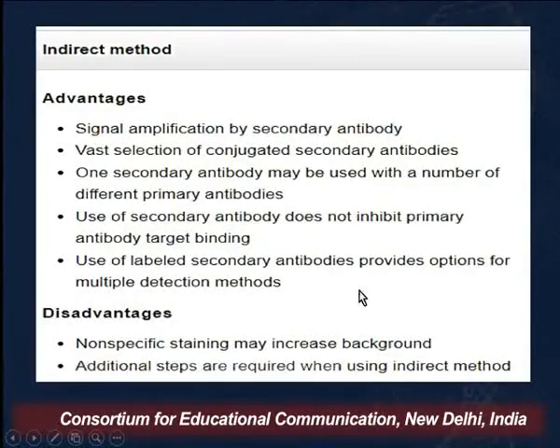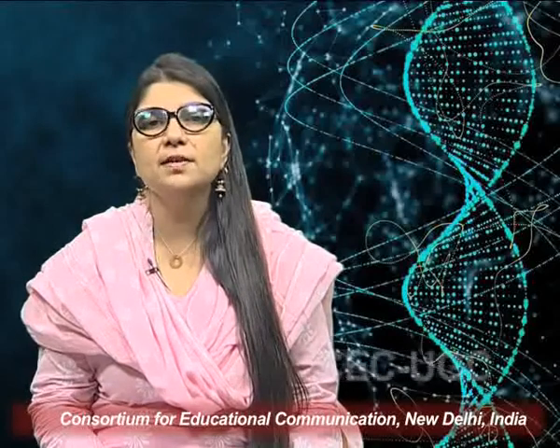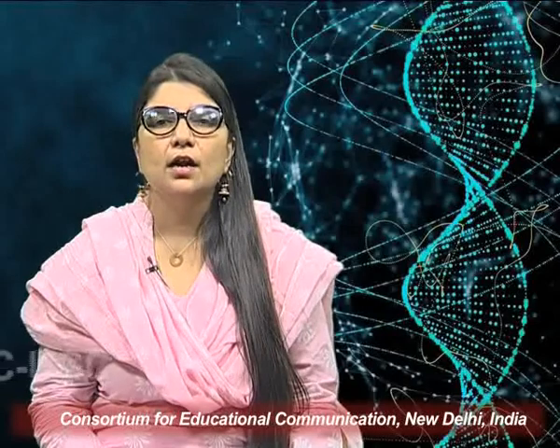The secondary antibody will obviously reduce the cost as well, because it can be used from a common pool. The important aspect is that the specificity needs to be ascertained. Wherever the primary antibody is raised in a species, the secondary antibody raised against that species will work best. There are certain disadvantages, as it also produces non-specific binding, because you are using an additional antibody, and there can be some additional costs, or actually additional steps.